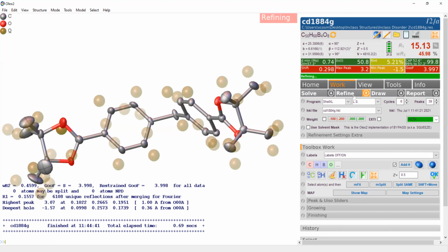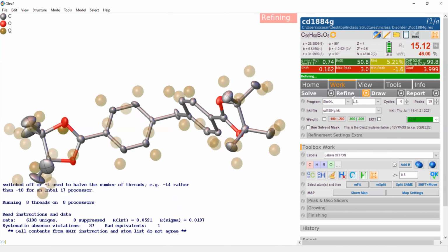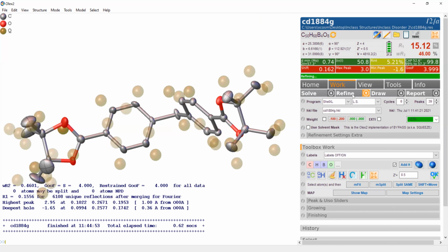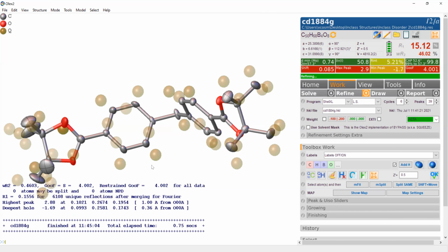It's taking its sweet time. One more time. Let's see if we can get it.